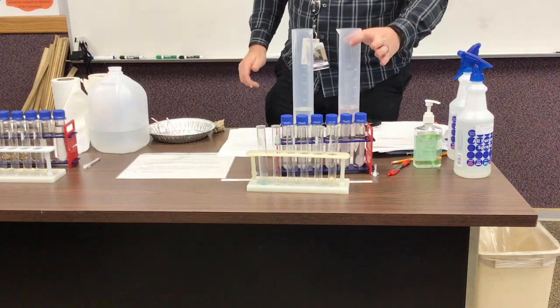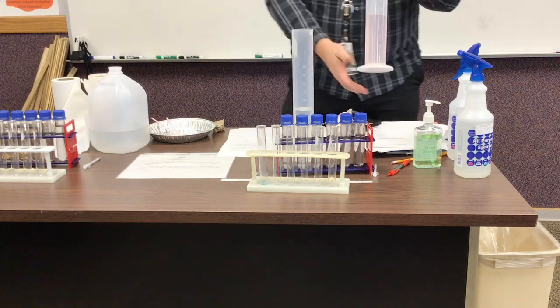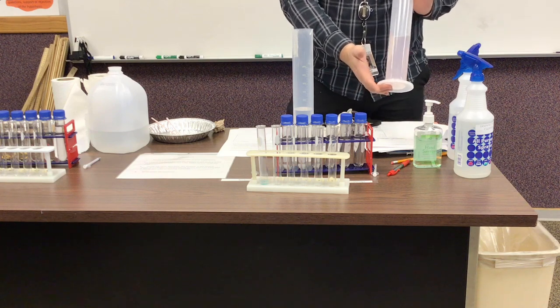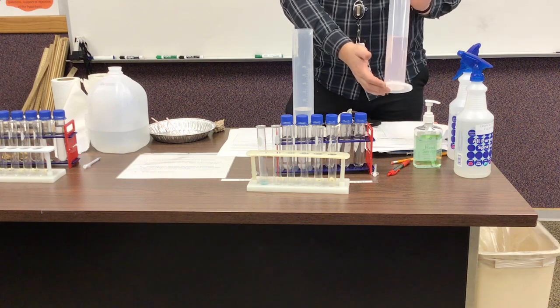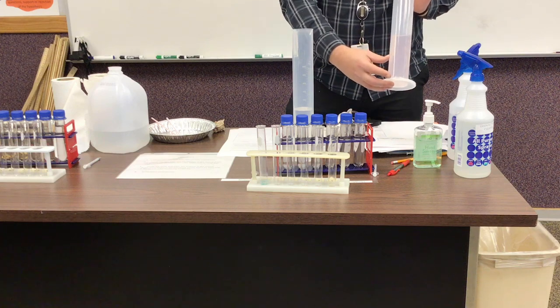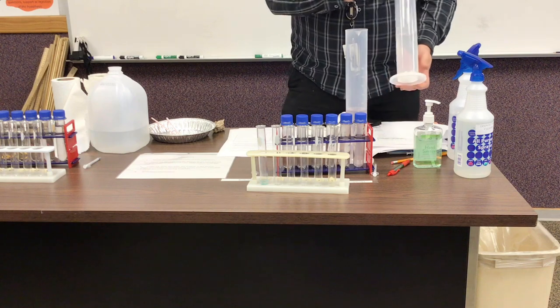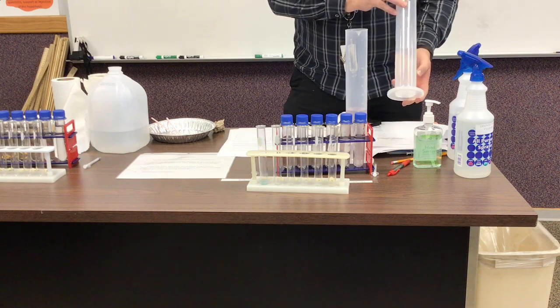This is experiment number one. Here is the copper nitrate — you need to record the physical state and the color of the copper nitrate. Here is the ammonium hydroxide.